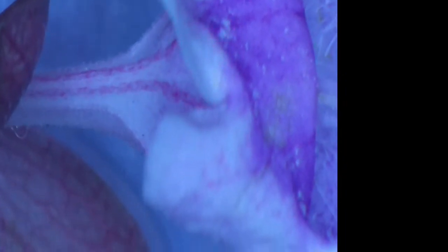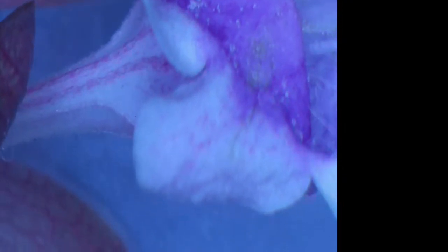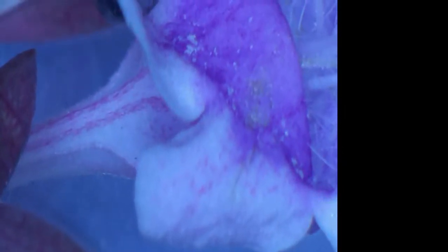Those are the basic flower parts there. There's some really nice venation inside the flower there. And sometimes there are colorful structures as nectar guides to kind of show insects where the nectaries are. Because, you know, insects don't do this for free.